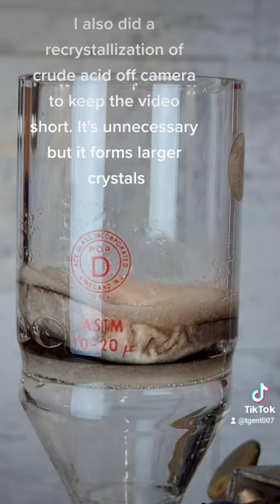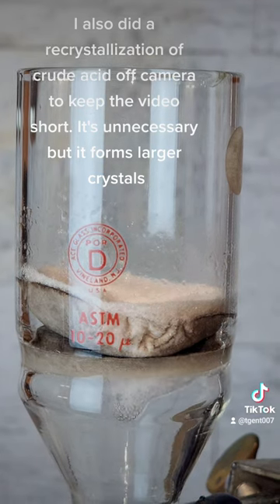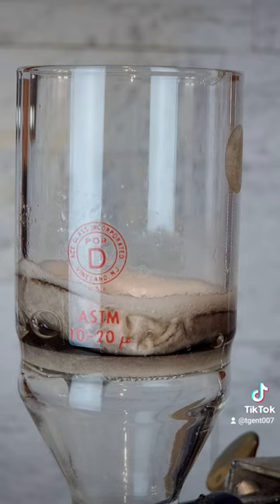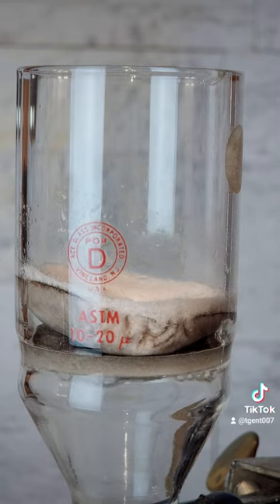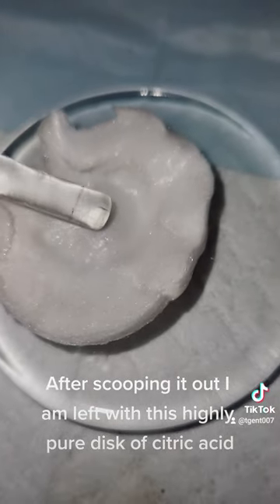This is rinsed several times with ice-cold water to clean the crystals. I also did a recrystallization of crude acid off-camera to keep the video short — it's unnecessary, but it forms larger crystals. After scooping it out, I am left with this highly pure disk of citric acid.